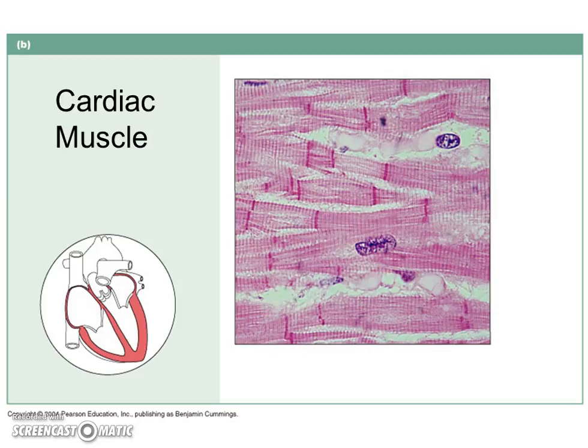There are three kinds of muscles. This is cardiac muscle. It is an involuntary muscle. It is striated. You see the little stripes. It has a central nucleus. They are short fibers that branch, and they are responsible for moving blood through the heart. Kind of looks like bamboo.